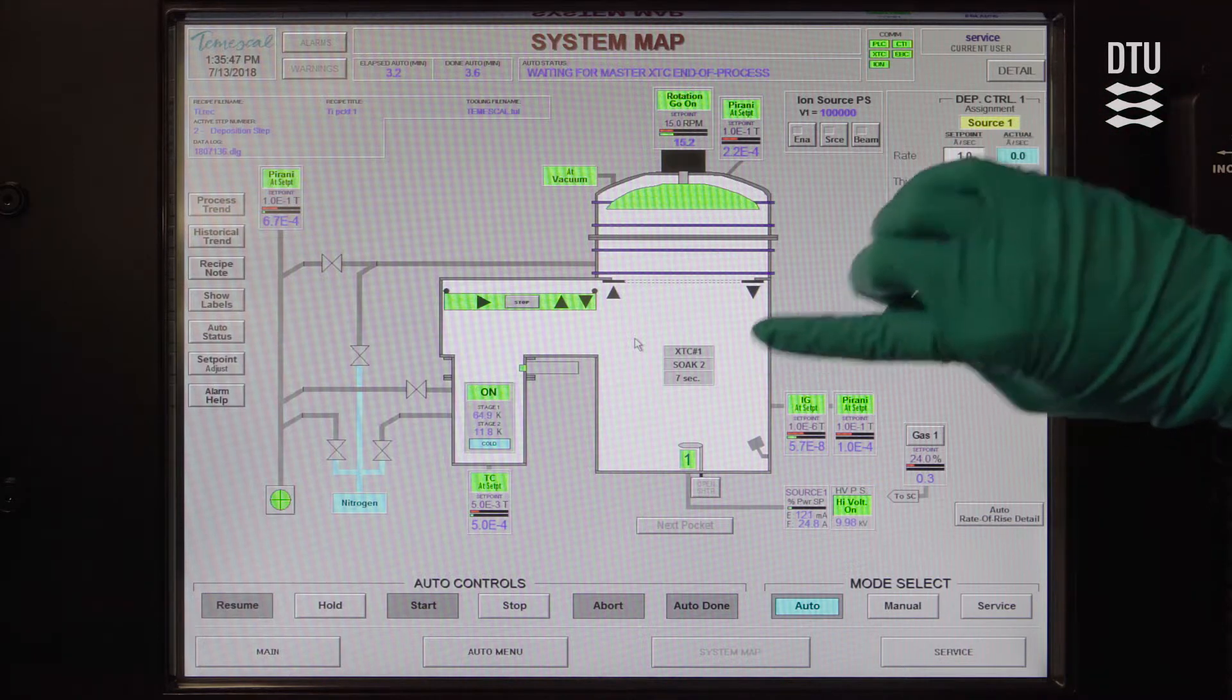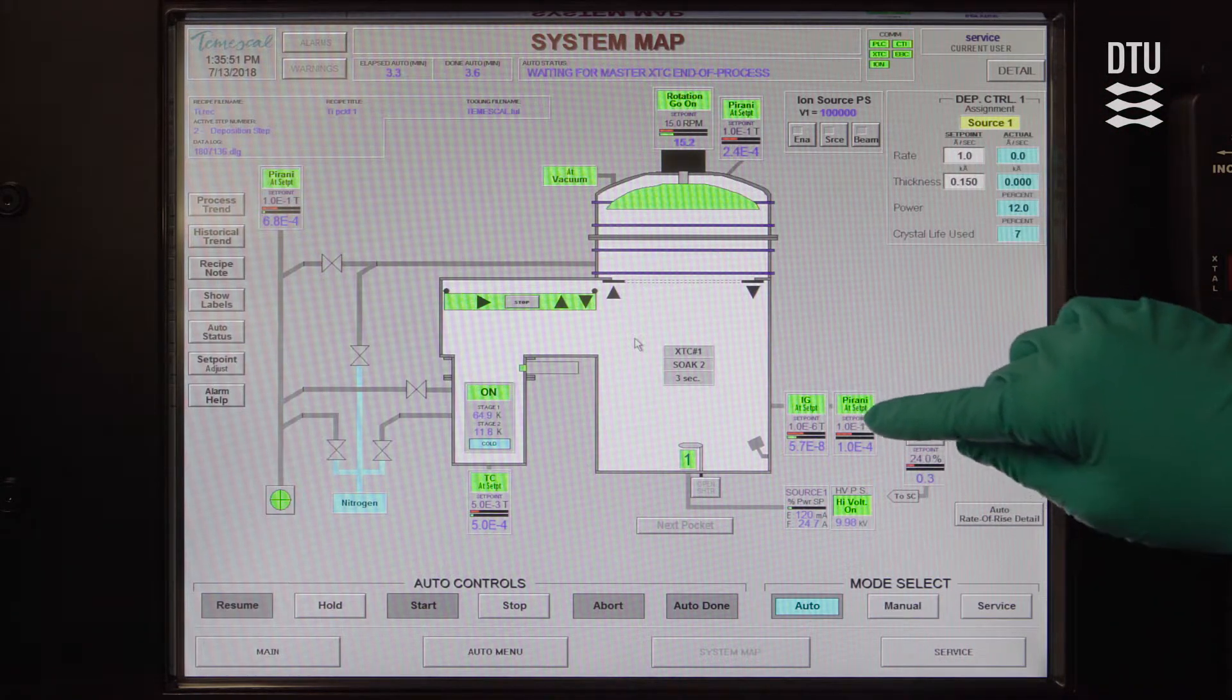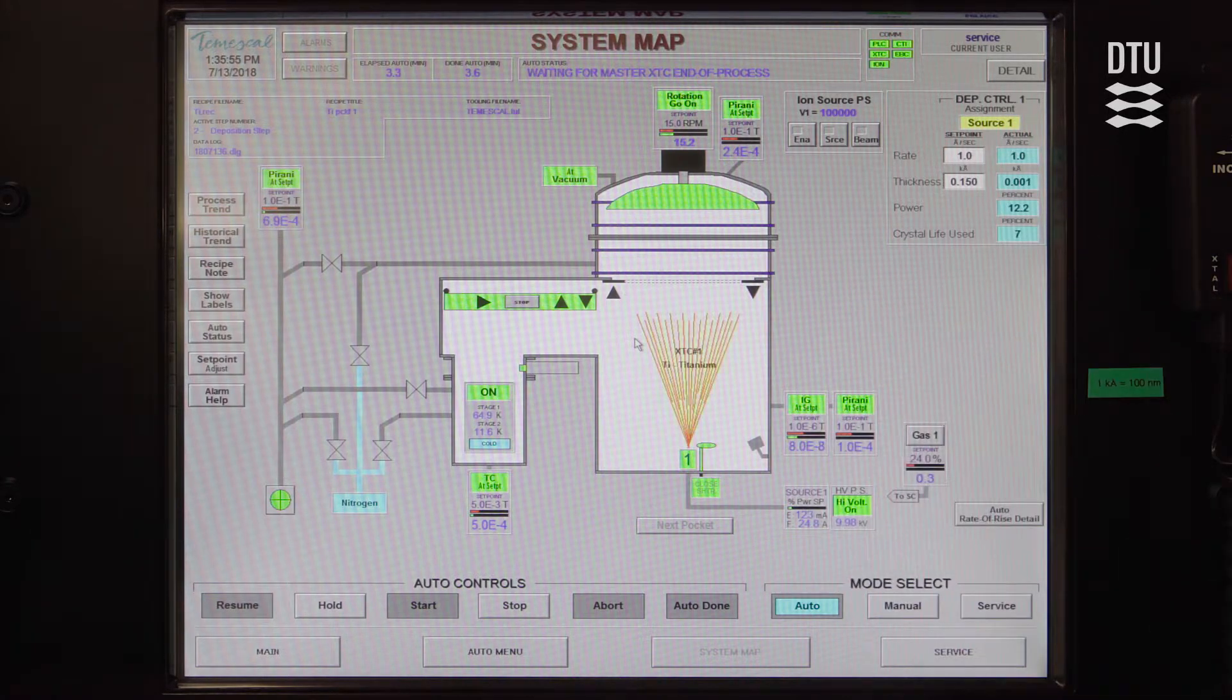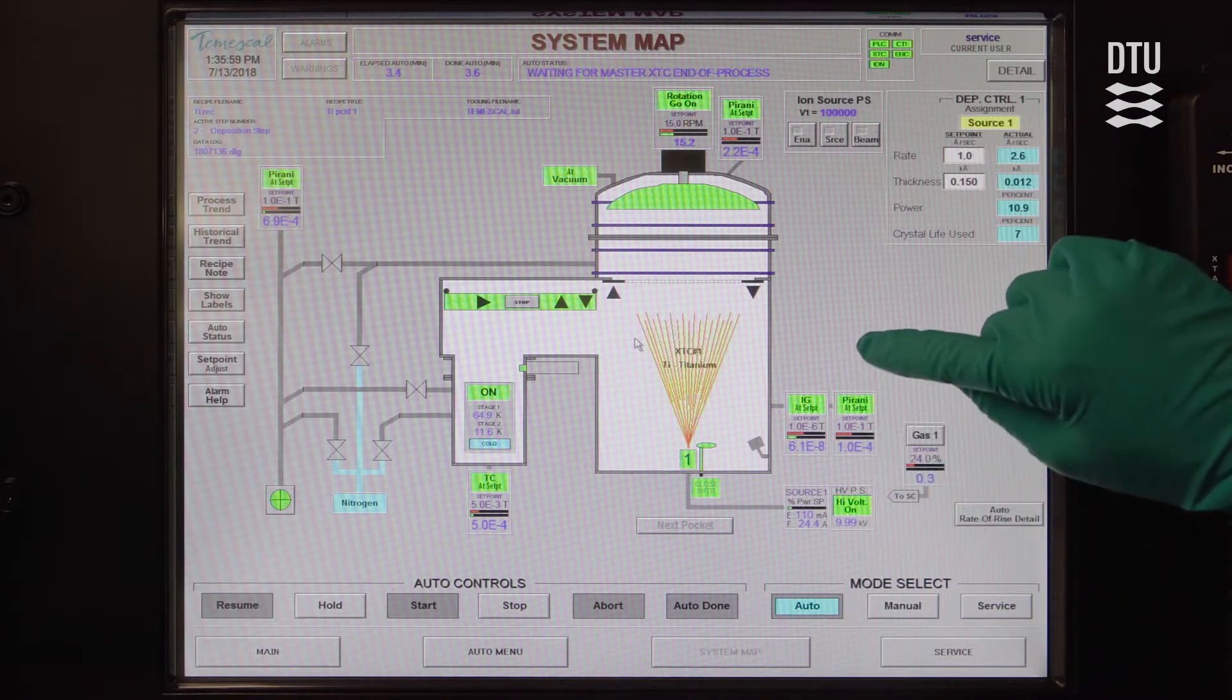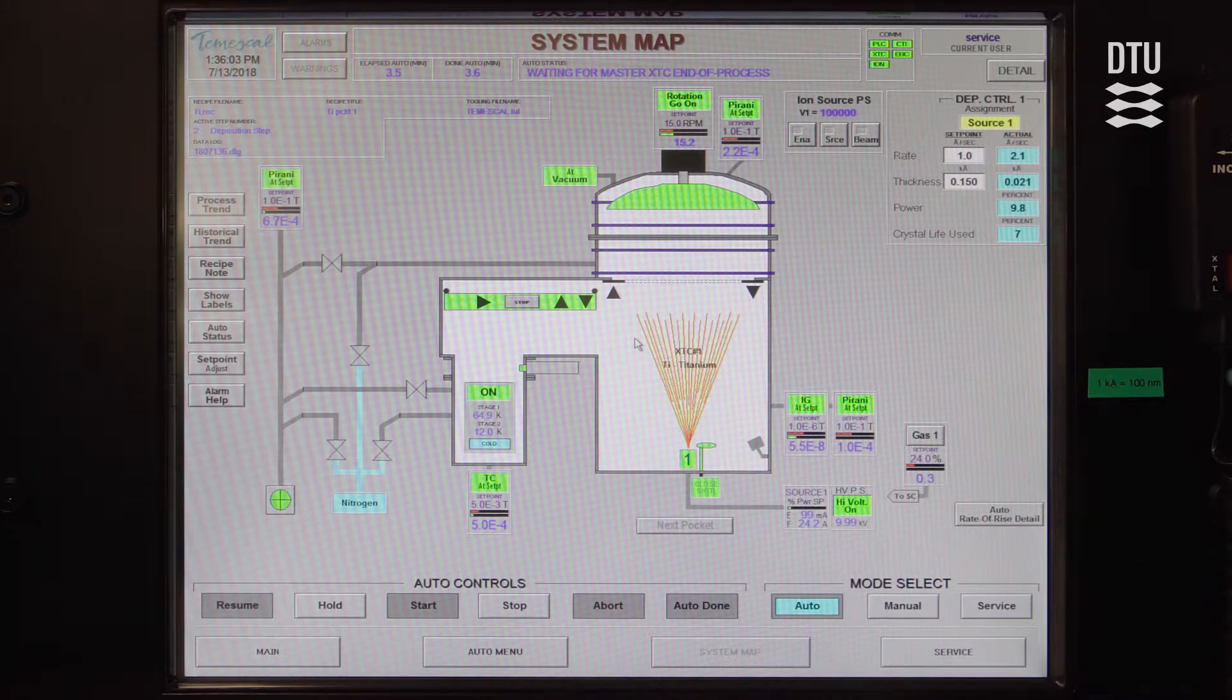So now we are getting very close to the deposition starting as the soaking is finishing. And then we can see in the graphics that now the deposition is happening. Again, have a look at the pressure. Make sure it's not rising too much and too fast.